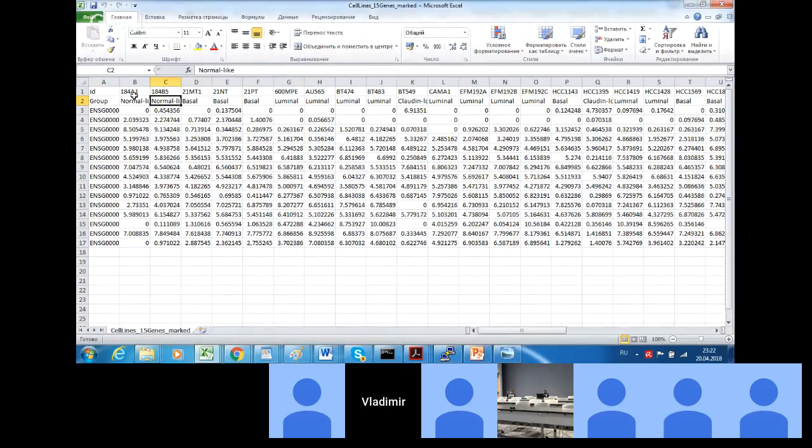This information is used by the plotting module to show the location of each group in the principal component analysis plots. So samples associated with the same group, in our case subtype of cancer, will have the same color.